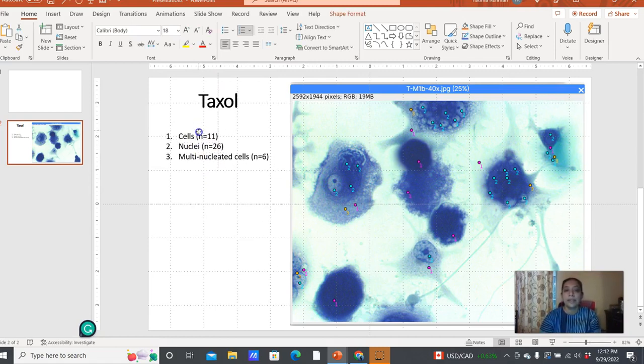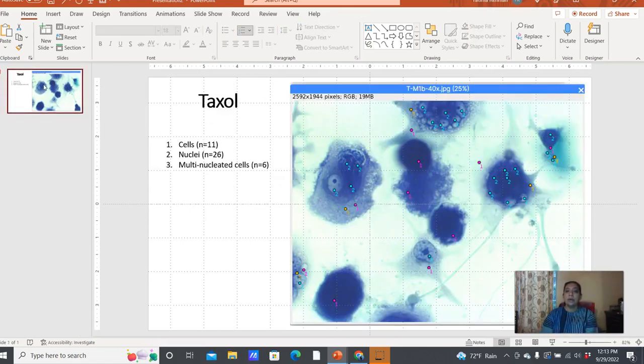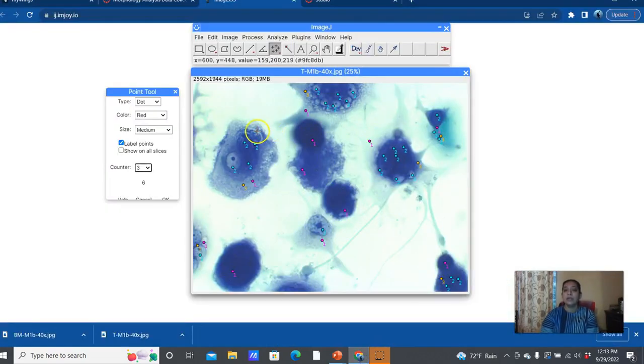Here's the other thing that you can do here. If you were using it for data collection, you would do that for each one of your 3 or 4 images: 3 images in your set that you are using for your main fields, 1, 2, and 3, and 1 from that other set that you will use to compare your data to other groups, with that 4th ImageJ slide. So you could even put your measurements here once you collect them. Now to make your measurements, you're going to be measuring 3 to 4 cells in each of your fields.